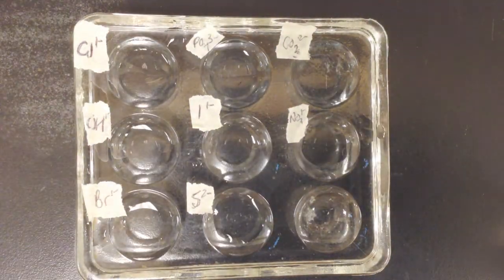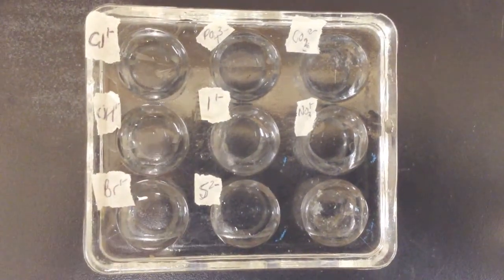Now, take a look at all these wells. I picked a clear reaction plate on purpose. I don't see any evidence of chemical change happening whatsoever. Let's go back to our chart and see what happens.